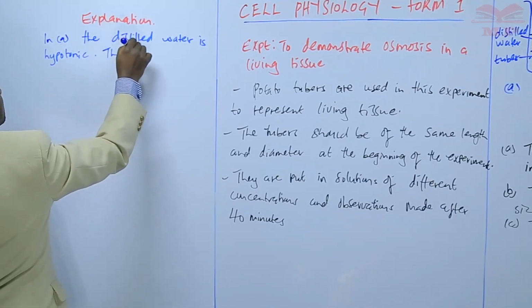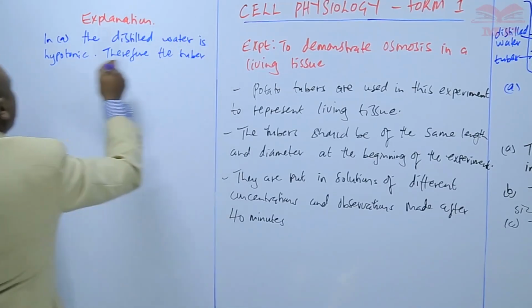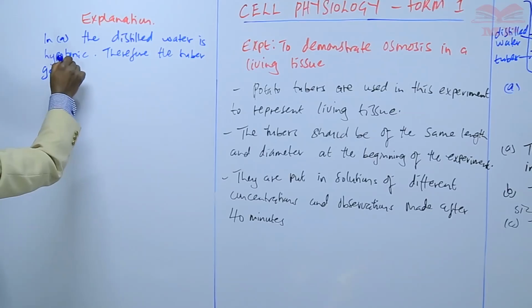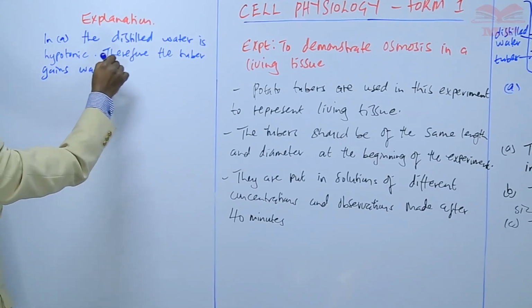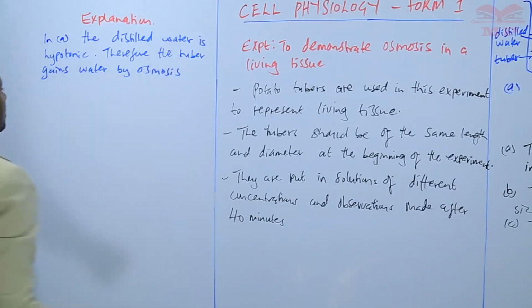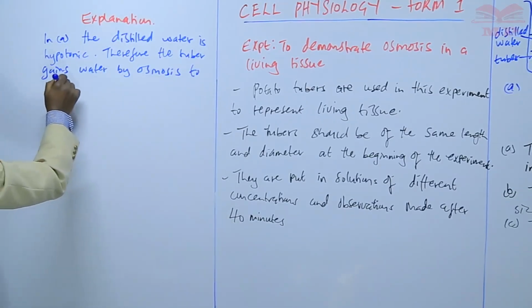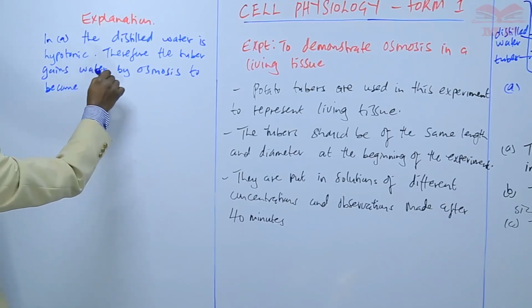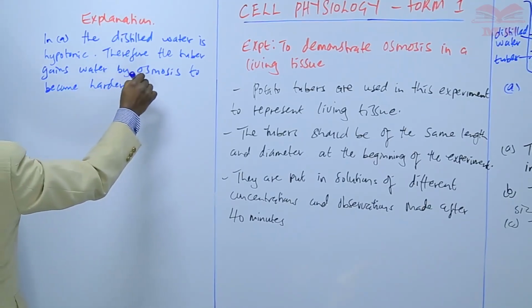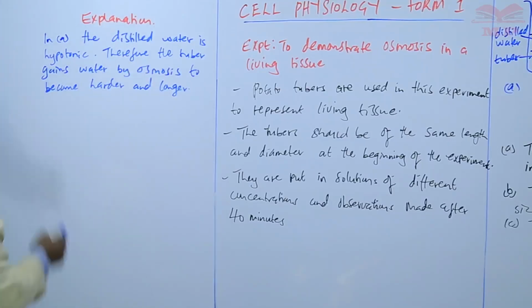Therefore, the tuber gains water by osmosis to become harder and longer.